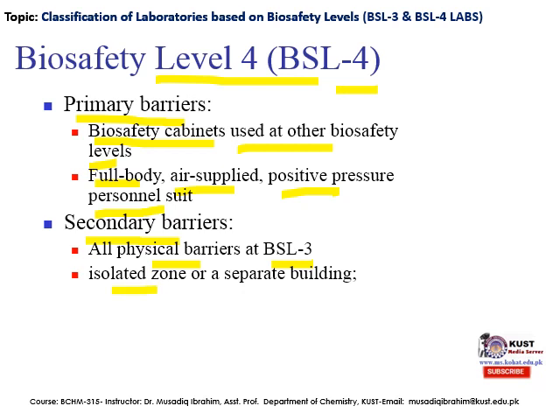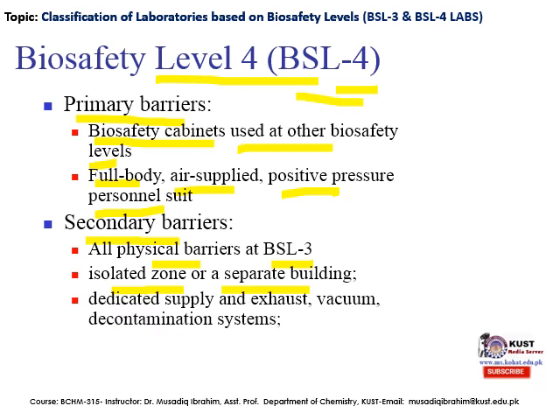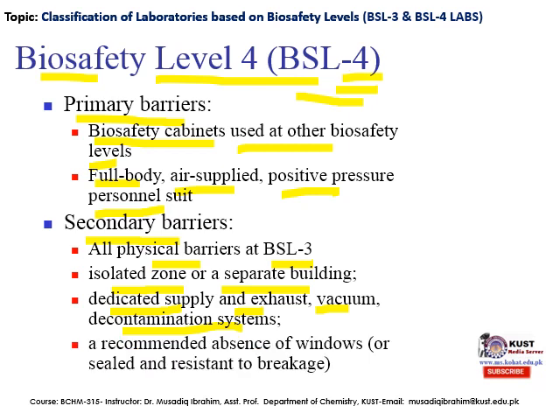And there is an isolated zone or a separate building for the BSL-4 lab, and dedicated supply and exhaust, vacuum and decontamination systems are also available only for the BSL-4 lab. And it is recommended that there be an absence of windows within the BSL-4 lab, which means there shouldn't be any windows in the structure of the BSL-4 lab. And if windows are present, then they should be sealed and resistant to breakage.